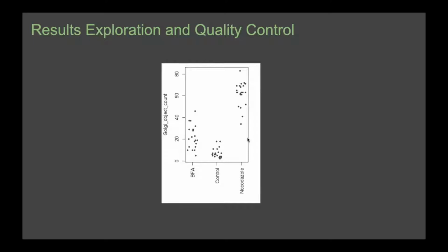In general, if you want a solution where you don't need to know too much, and it's more this machine learning based approach where you basically draw annotations, I think the most popular software is something called ilastik. Okay, maybe I misspelled it. So ilastik, and that's very popular for general segmentation purposes. So that's maybe the one I can name.